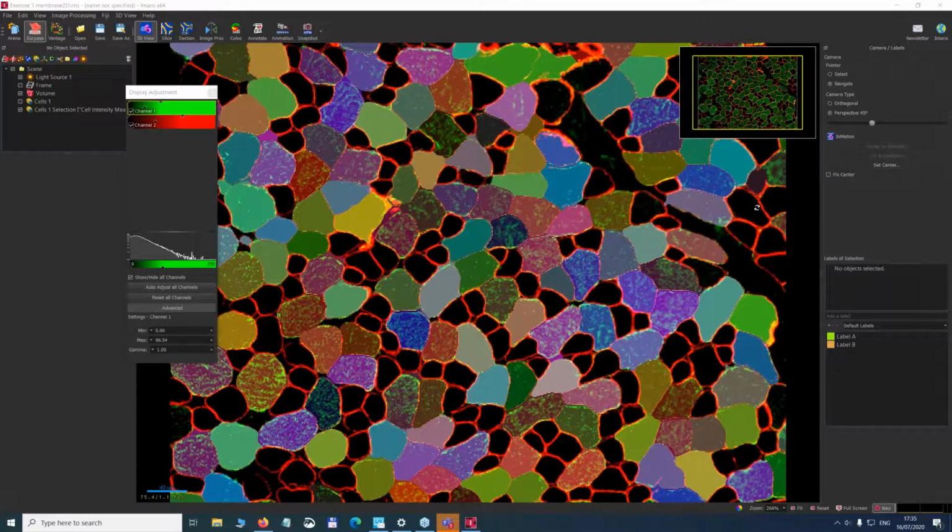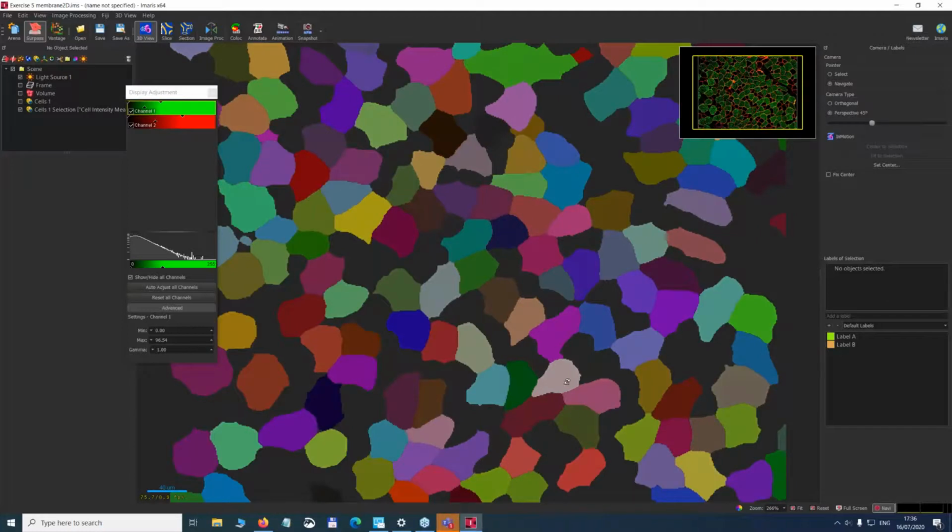So I would just add that definitely there can be various different types of cells, and you can maybe run a first run, see whether it works for a wider spectrum, and then maybe it would be more interesting to start sorting them afterwards and export them separately. So for example, in this 2D data set, I have exported separately those which have the green signal. Of course, you can extrapolate it into more various scenarios, and then you can export, for example, 5 different types of cells. So definitely it is possible. Awesome, thank you. That's a really good point.